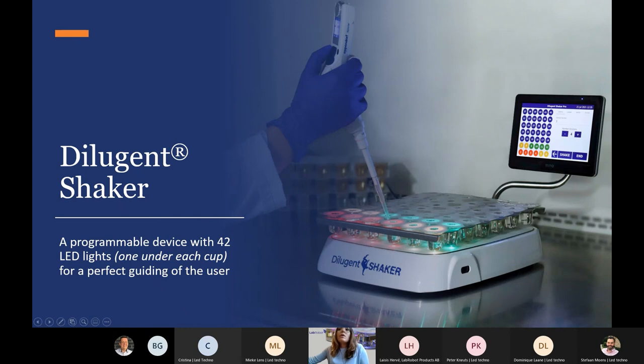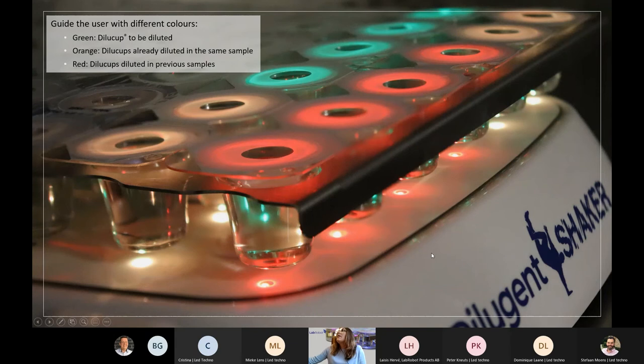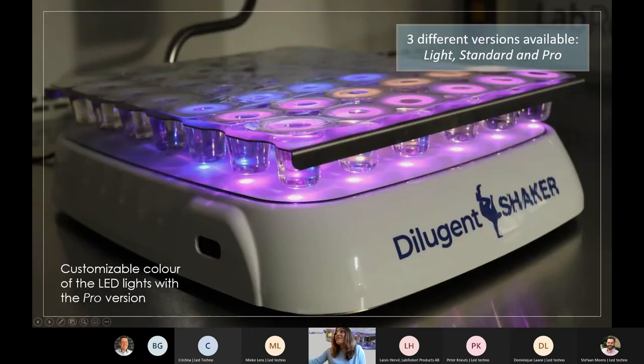The Dilution Shaker is a programmable device with 42 LED lights — one under each cap — that guides the user with three different colors. The LED lights in the matrix exactly match the on-screen display, making it very easy to follow the guidance. Green caps are the ones to be diluted next, orange are the ones already diluted in the same sample, and red are the ones diluted in previous samples. With Dilution Shaker Pro you can even change the matrix colors, which is useful if you are color blind. There are three versions: Light, Standard, and Pro.